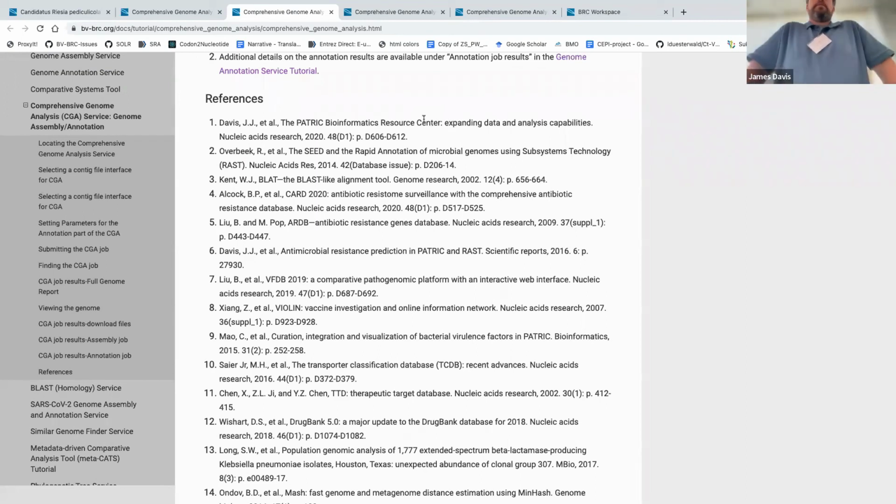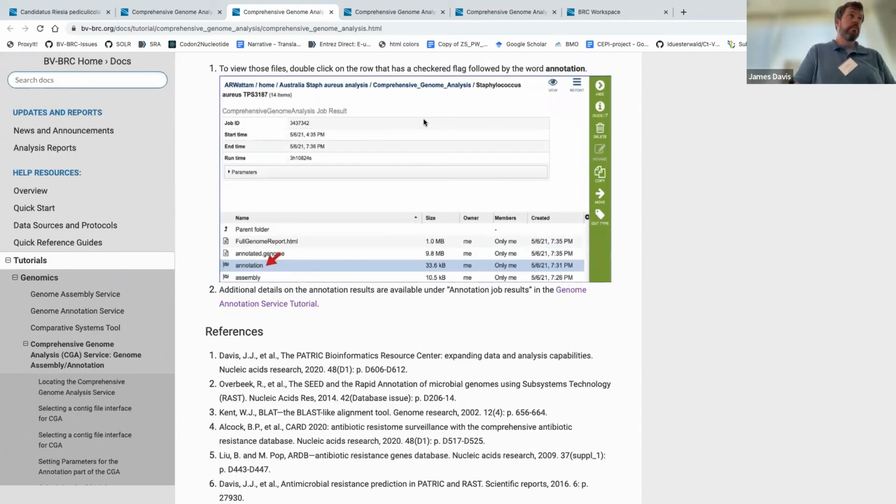I've got those here for you, so you don't have to try to figure out exactly what version of the assembler we used and what algorithms we use. It's there for you, and in fact, there are places where you can just cut and paste. The way I was envisioning it is to take it for your materials and methods section and just dump it into that. And then, of course, with EndNote or whatever, you're going to have to put in those references.